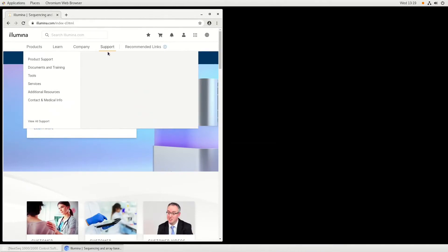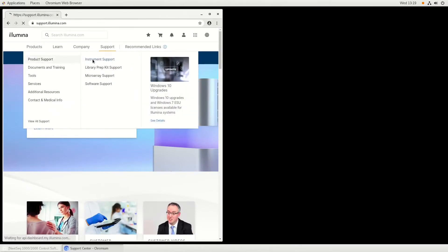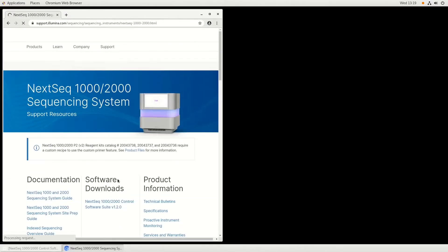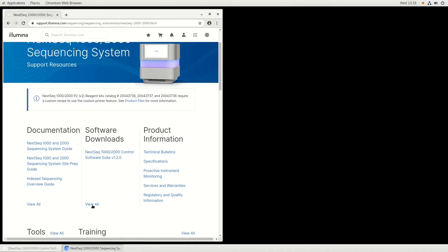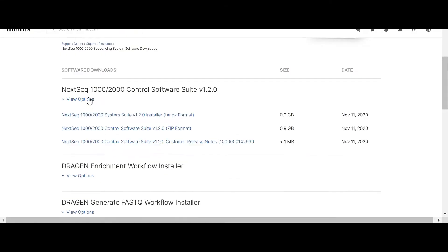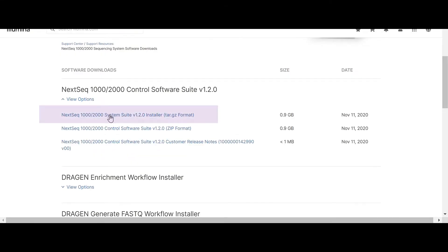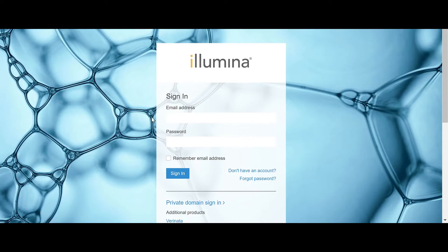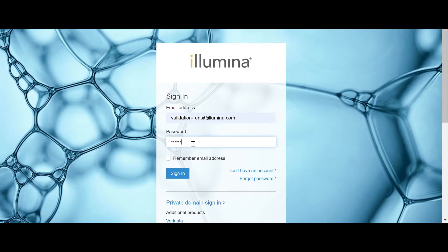Select the Support tab, followed by Product Support and Instrument Support. Select the down arrow next to NextSeq and choose the NextSeq 1000 and 2000. Under Software Downloads, choose View All and select the Most Recent Software Suite .tar.gz file. At the login screen, use your My Illumina or BaseSpace credentials to proceed with the download.